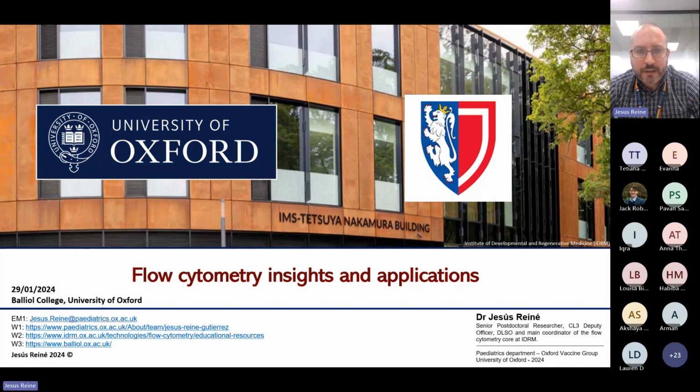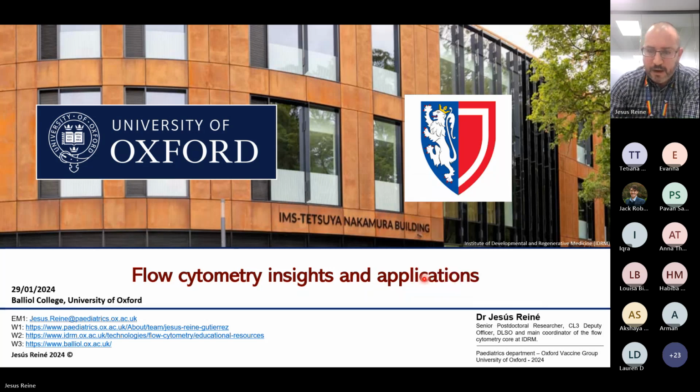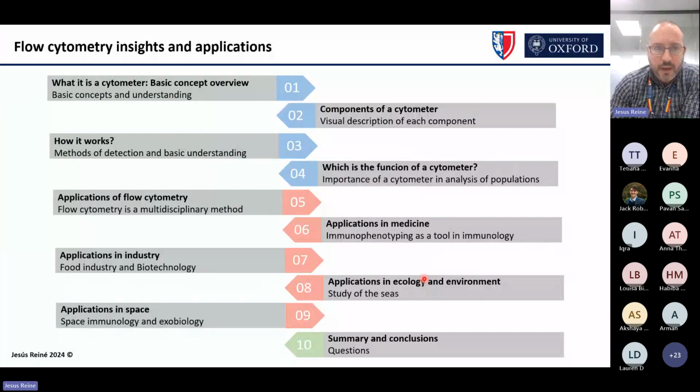Future. So basically today, we're going to talk about flow cytometry, insights, and applications. We're going to talk about a few things that are based on flow cytometry. First of all, I would like to explain what a cytometer is. We are going to do a very basic concept overview of the methodology and how it works.